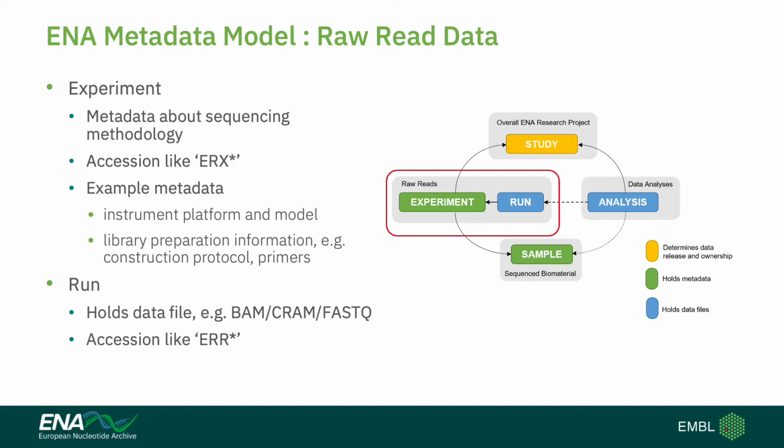Raw read data is a little unusual in that it comes in two objects. The experiment really holds the information about what kind of protocols were used for the sequencing experiment, and then the run object really just holds the data files themselves.